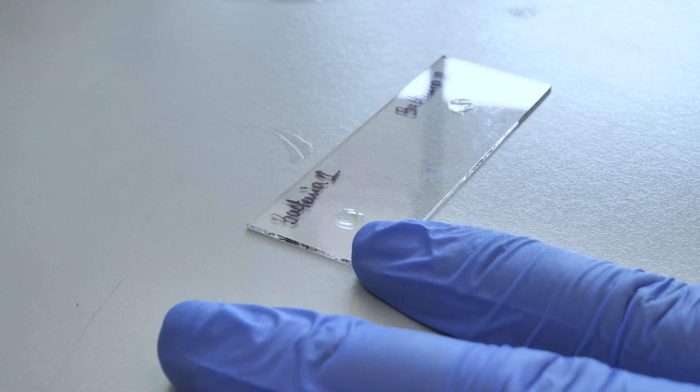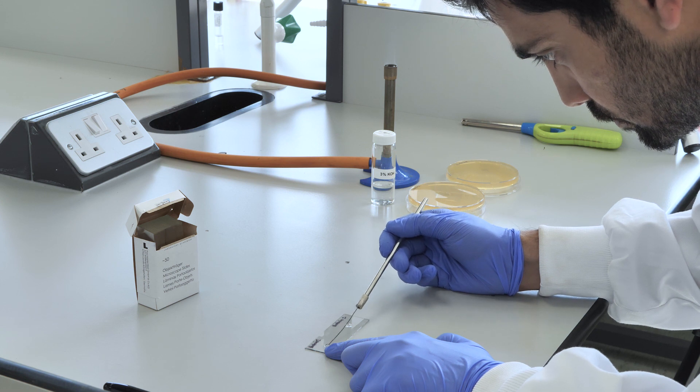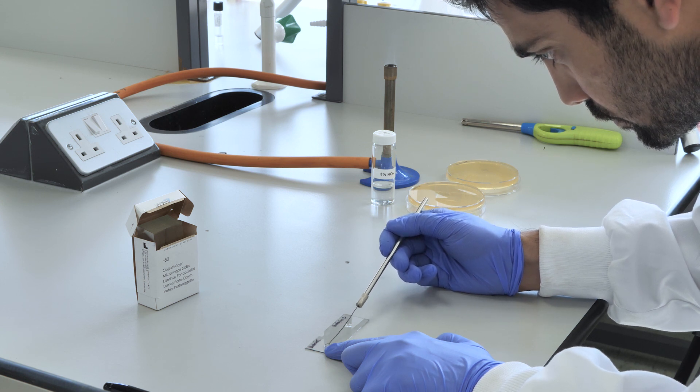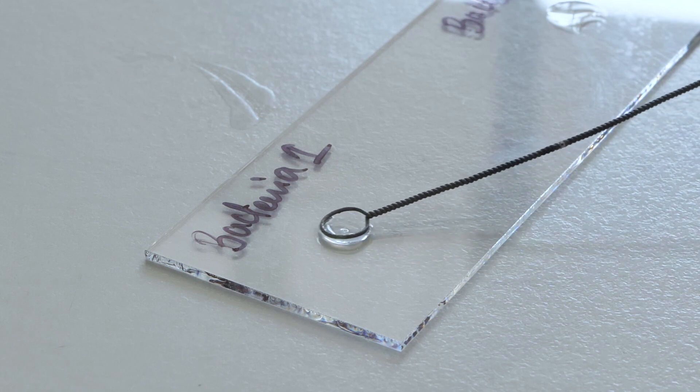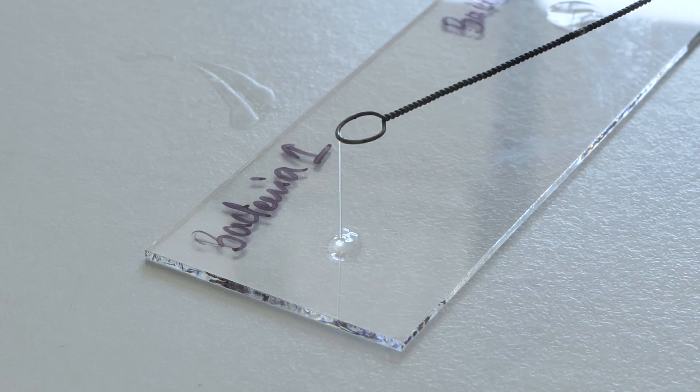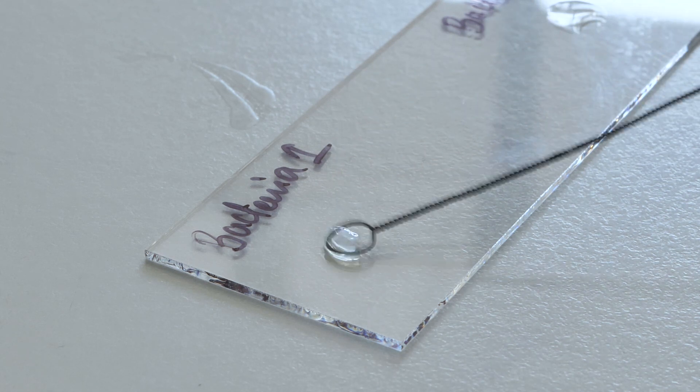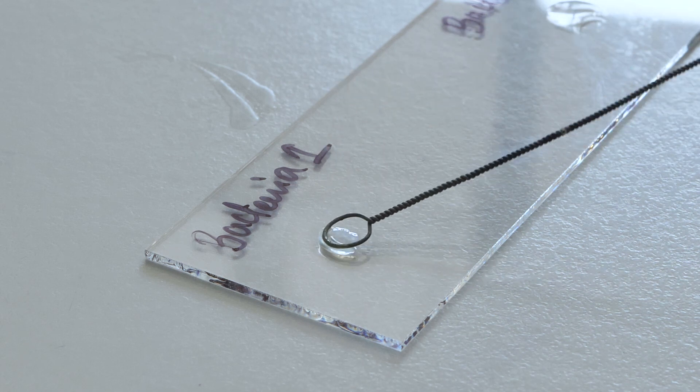A positive KOH test will be indicated if the solution becomes sticky and stringy when you slowly lift the loop up and down on the slide. This result is indicative of a gram-negative bacterium.